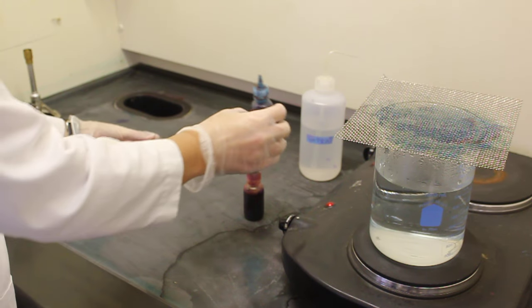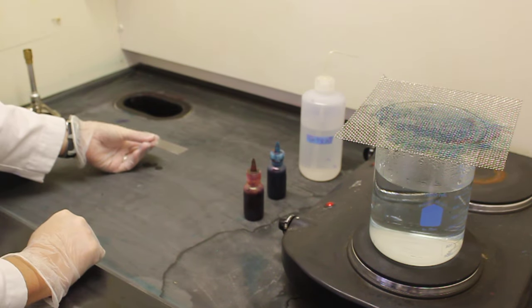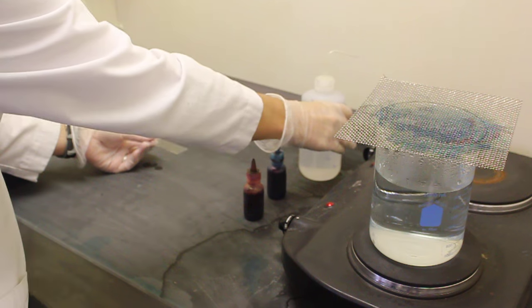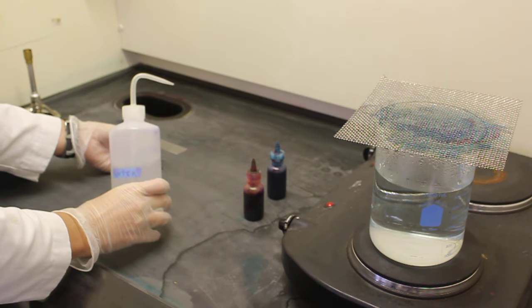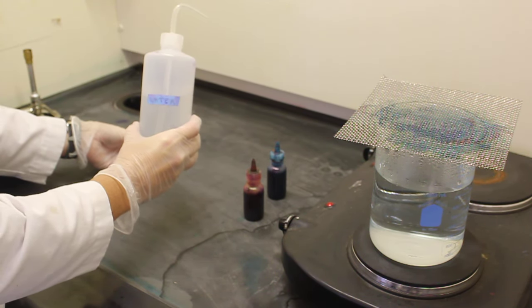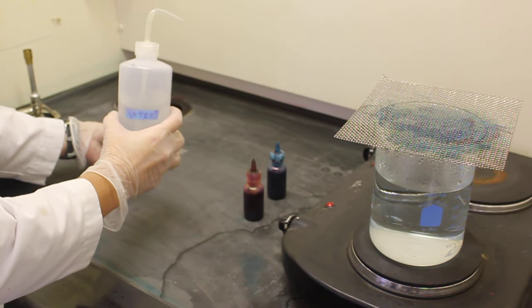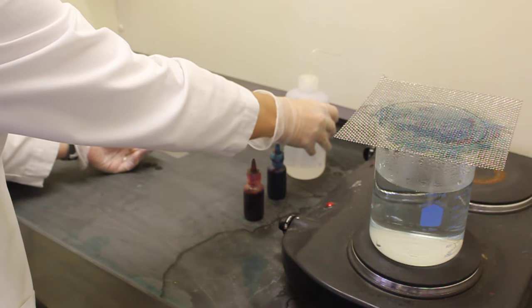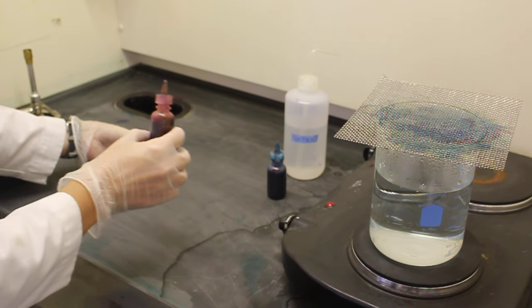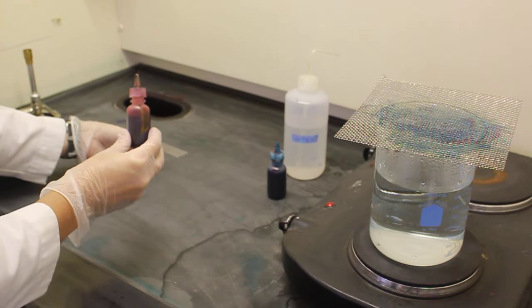The second step of the endospore stain is a decolorization step. In this procedure, we will use water as our decolorizer instead of ethanol. Ethanol is too harsh to use for the endospore stain. Our third and final stain is the counter stain safranin.